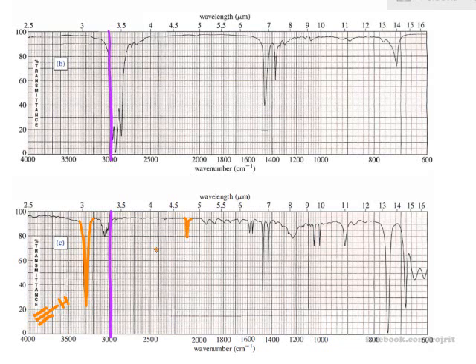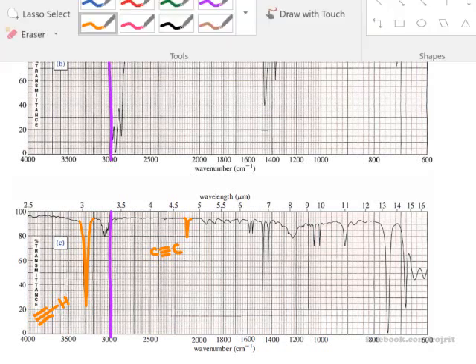This is the alkyne characteristic stretching, but it appears as a not very strong signal. Actually, if I were doing this, I would apply more sample in the sample holder to see stronger absorption. But anyway, this is it.